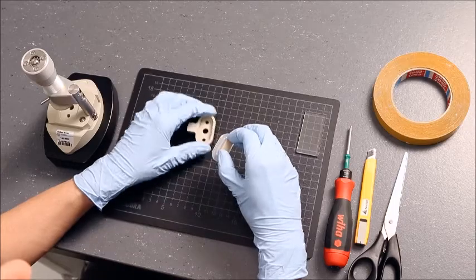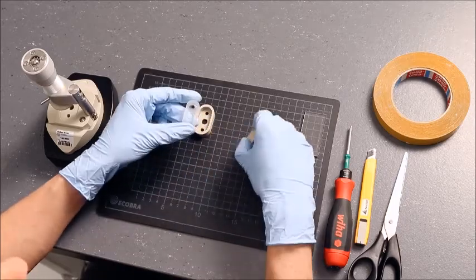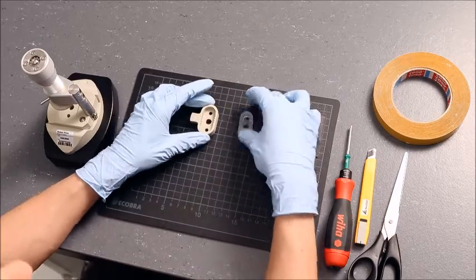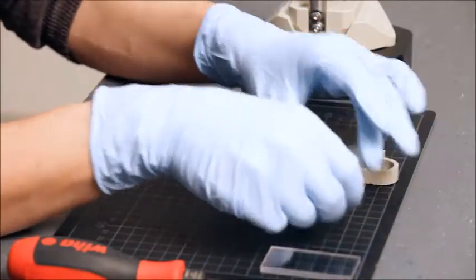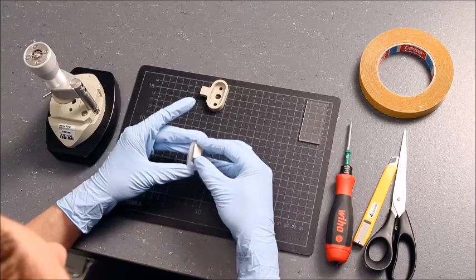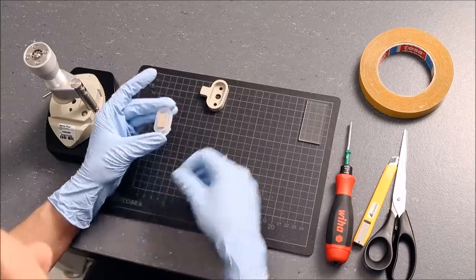If necessary, dry the gasket and the insert. Place the sample holder in the gasket of the insert for the clamping cell. Pull the sample holder into the gasket.